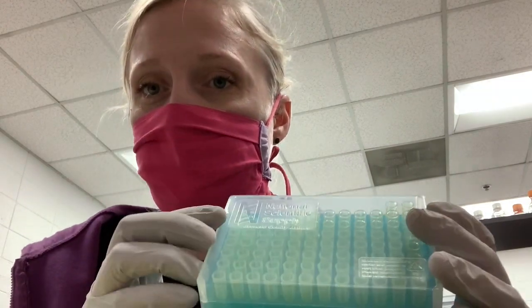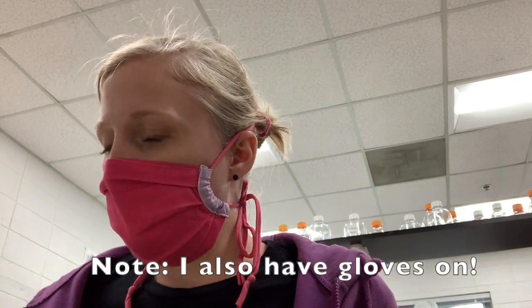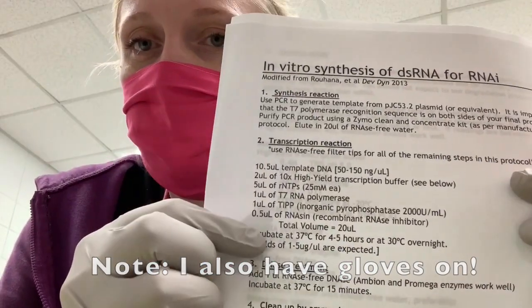So when we're doing RNA work, we're going to use a couple of strategies to minimize the contamination of our samples by RNases. For this protocol, it says use RNase-free filter tips. So you're going to be using all of our filter tips. All of these materials should be RNase-free, and you're going to be really careful to use RNase-free tubes. If you've had tubes sitting out on your bench, you don't want to use those. Grab a fresh bag.